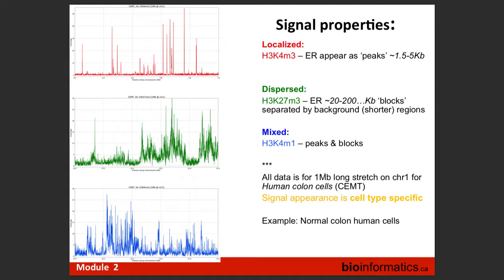And then if we look at H3K4me1, which is an enhancer mark, it's very complicated because it's a mixture. So sometimes it has a very strong cluster of enhancers probably, or maybe it's, like you heard, super enhancer is the word, where we have a stretch of DNA which is covered by binding sites, and then we have really localized peaks. So we have both.